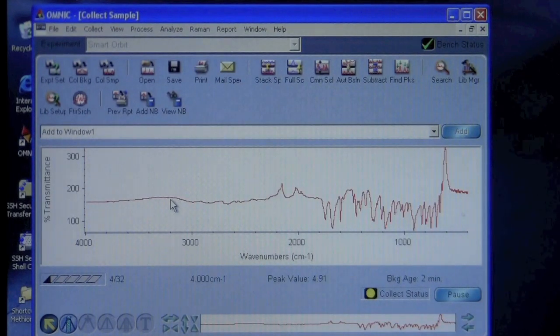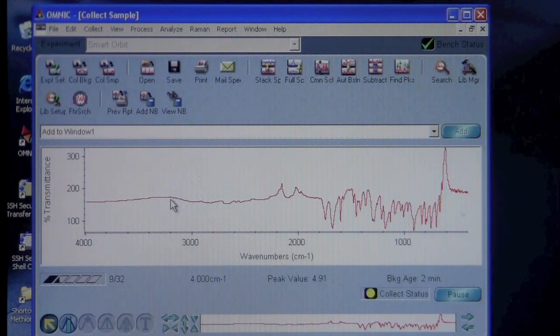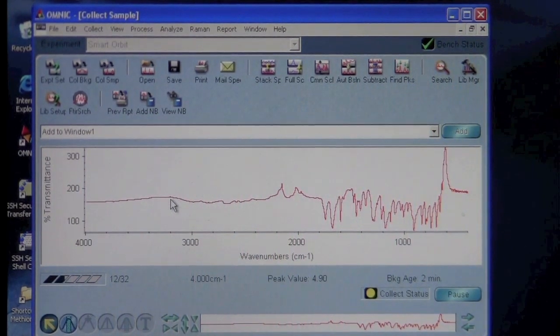It's currently doing that. When it's finished, it should bring up a window telling you that you can add the spectrum to the existing window here. That will come up in just a second.